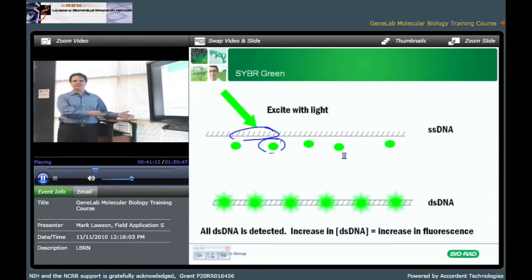Whereas everything other than the DNA staining dyes is going to cause a substantial increase in the cost of each reaction. So the mere fact that we all have limited grant budgets means that we try to get the most amount of data out of our reagents. SYBR Green is the most cost effective. But it has a lot of downsides. It's not specific. It's not multiplexable, right? One other advantage it does have is the ability to do melt curves.